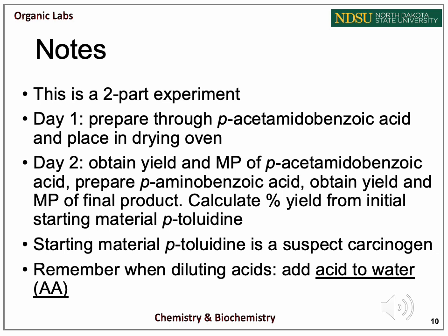Also remember that para-toluidine is a suspected carcinogen, so please be careful and use gloves and goggles when handling. A final note, when you are diluting acids, you want to always add the acid to the water. Remember, add acid AA. This is a very important step.